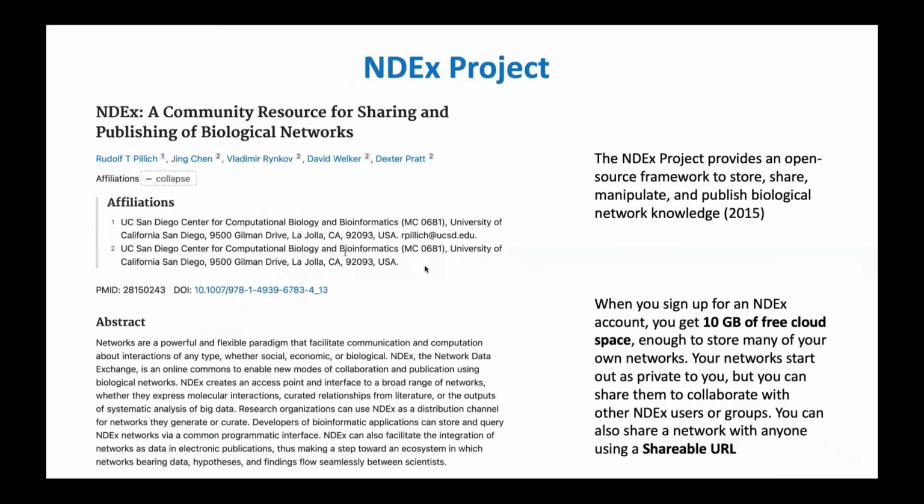And what this is, the project, just a few words. It's an open source, free for everyone framework, a web where you can store, share, manipulate, and even publish networks. So you can share privately, and you can share publicly, just publish.